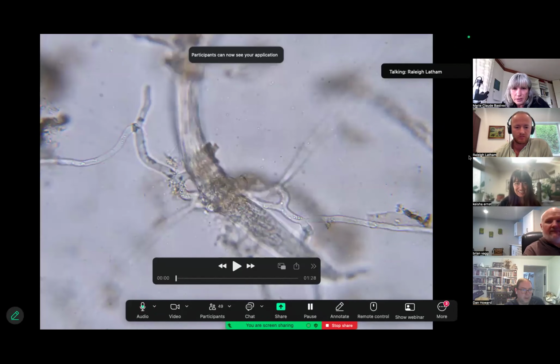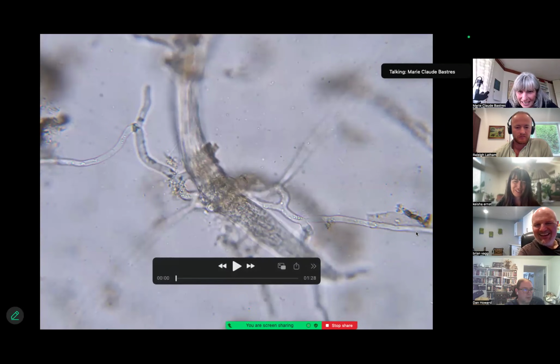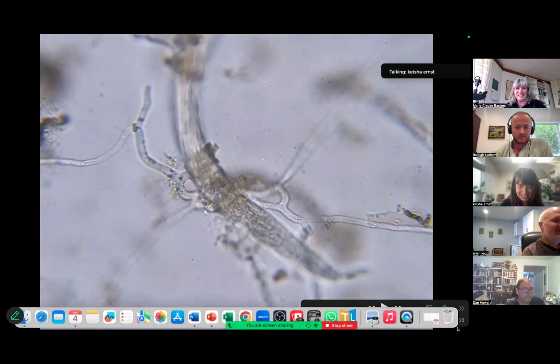Ooh, cool. Can you see that? Yeah, we can see it. That's a good one. That's a really good one. Wow, that's a great one. Jealous of your compost, Marie. You've got the best.